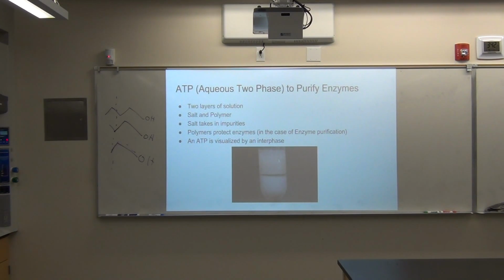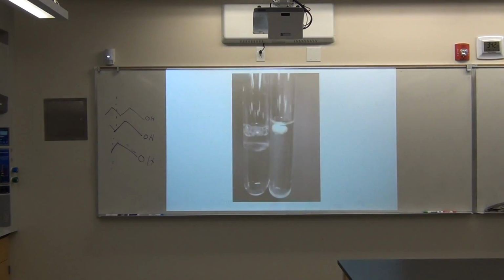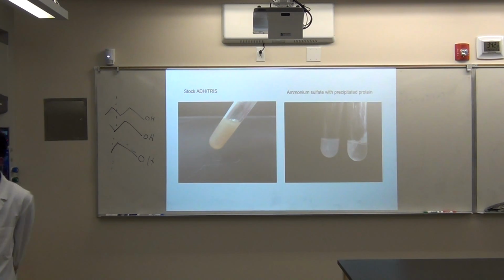So now that's another thing that's got to be incorporated. In fact, I think from now on, every isolation and everything that we do will be done with the saturated tris buffer. However, when we created our stock with the saturated tris and we were salting out the protein, it wasn't as pure as when we used the regular tris and salted out the protein.